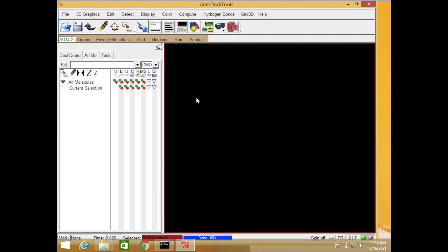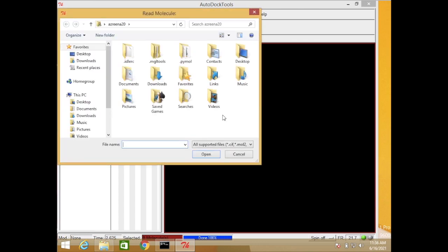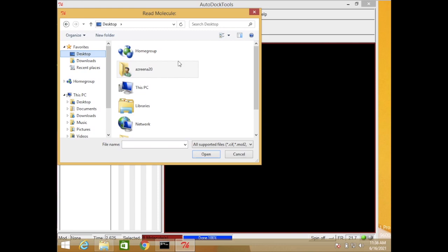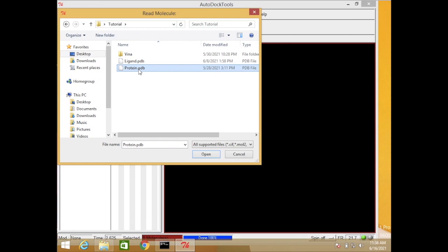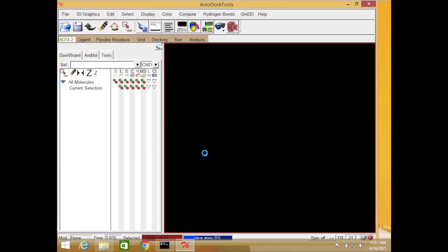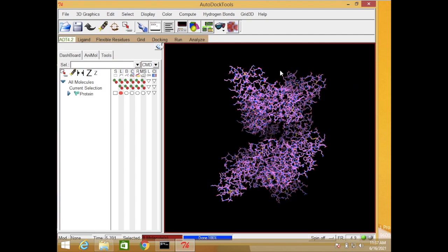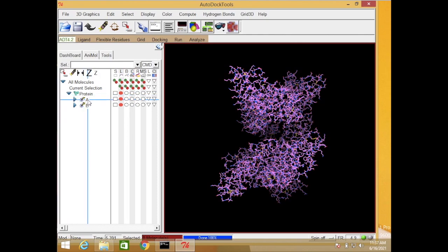First of all you need to add your macromolecule structure, which is our protein. Just click File and then Read Molecules. I'll navigate to my desktop where I have all my files. This is my protein — open it. Okay, my protein has two chains: chain A and chain B. I can see that here.